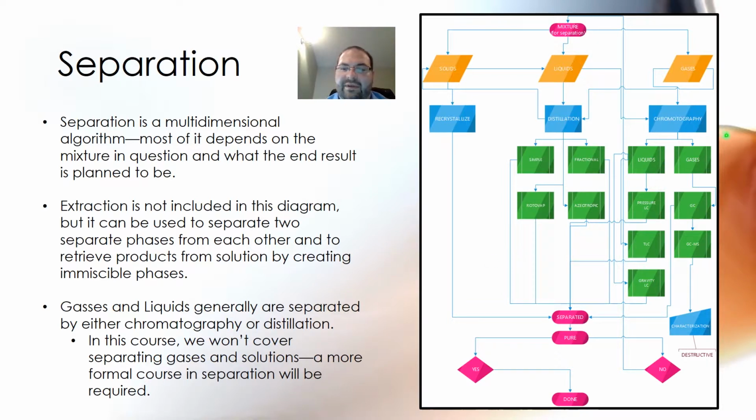And then chromatography, you have mostly liquid chromatography when we talk about things that you're trying to separate with the liquids, or where you're trying to use a solid to dissolve in a liquid and then work it into a column to be eluted through. That can sometimes be done. That would normally happen in a gravity column. So you have gravity liquid chromatography, you have pressure liquid chromatography, you have thin layer chromatography.